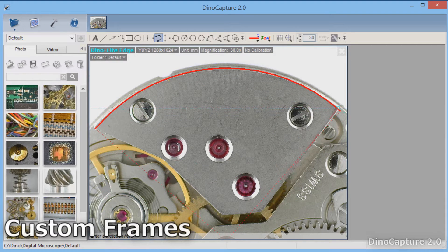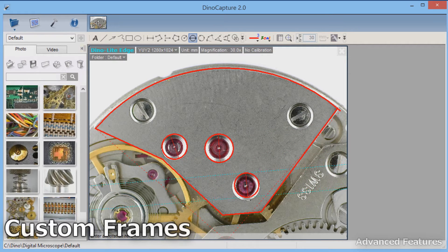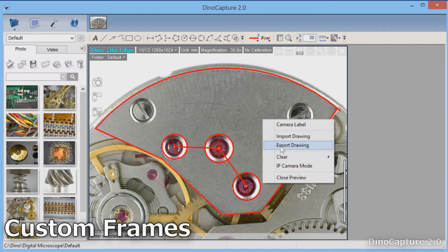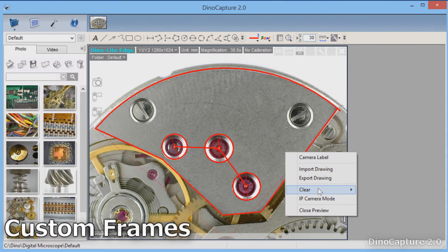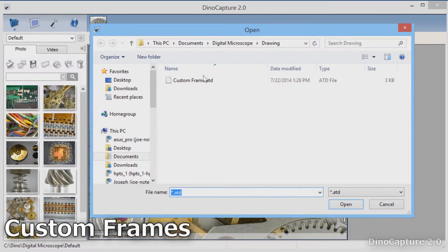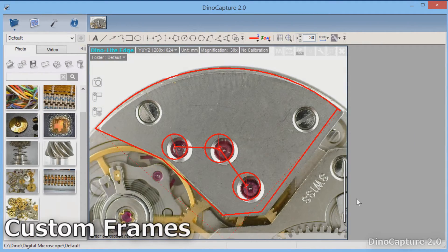Users can create custom frames that can be exported and imported for consistent inspection uses. Simply create the frame using the drawing and measuring tools, then right click in the window and select Export Drawing. Choose a file name and save. You can create countless custom frames that can be easily loaded by right clicking and selecting Import Drawing. Select the desired frame and it will appear on the live image.